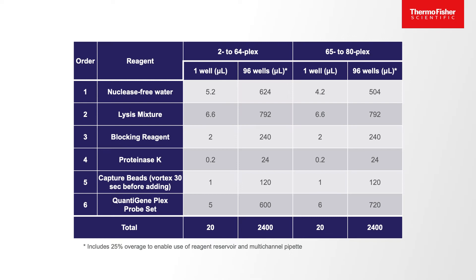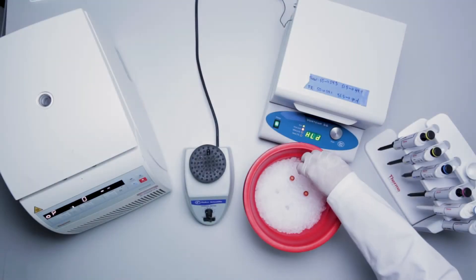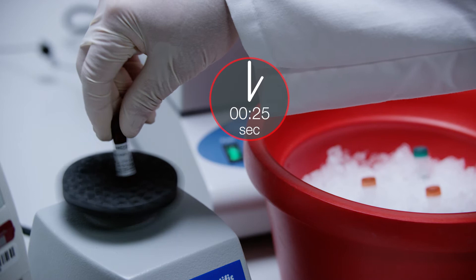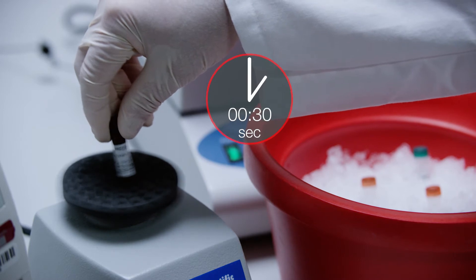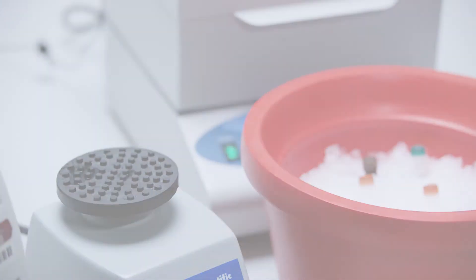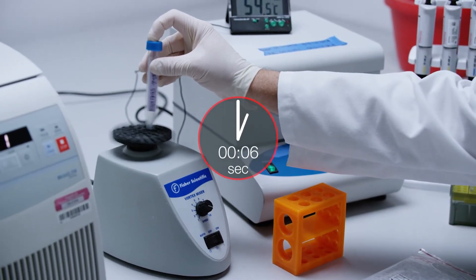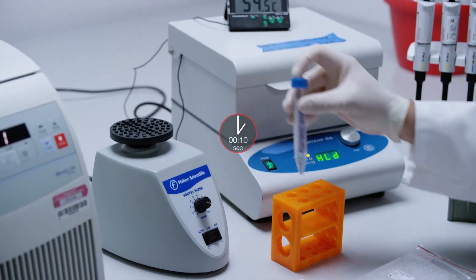Follow the instructions in the product user guide to prepare an appropriate volume of working bead mix. Pipette the reagents in the order listed in the user guide. Vortex the beads for 30 seconds at full speed to ensure a homogeneous mixture before adding them to the working bead mix. Vortex each bead mix again for 10 seconds and transfer to a reservoir using a pipette filler.